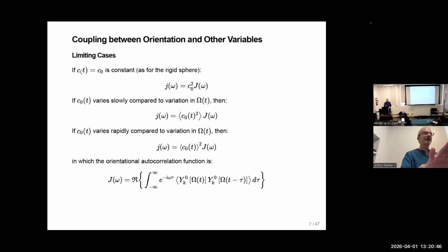But you only see one set of ortho peaks typically, and that's because the aromatic ring is flipping, but they flip relatively slowly compared to tumbling. The tumbling autocorrelation function has already decayed, but you haven't decayed the autocorrelation function for the ring flips yet.